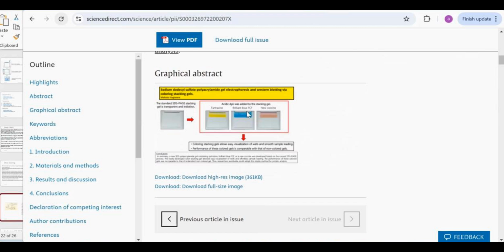So how can you have a gel where the areas in the gel are having different pH? A single gel with different zones having different pH. This can be achieved by addition of ampholytes. So we have to talk about this technique in detail in the next session, maybe today or tomorrow. But isoelectric focusing is possible, and here you can differentiate the protein polymorphs, right? So based on the pI values.